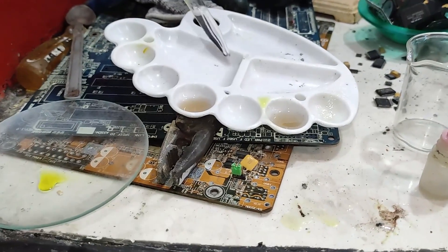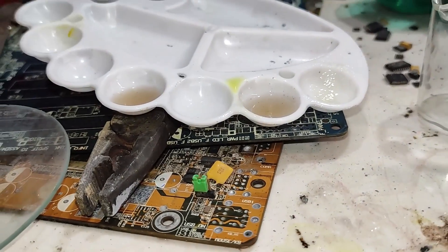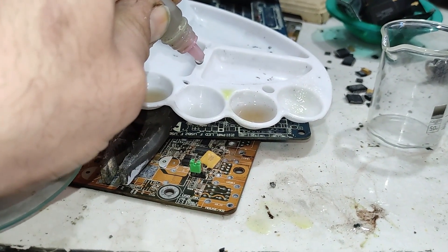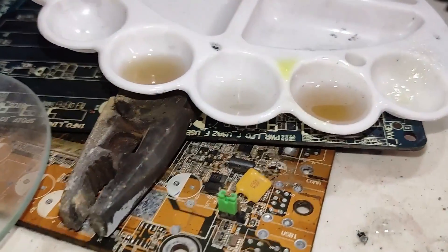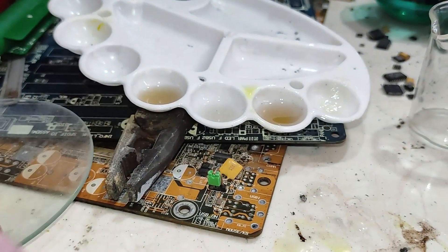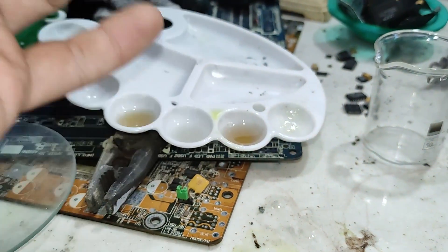As a control witness for this test, I'm going to add some tap water and add stannous chloride to it for comparison. The stannous chloride with tap water is a bit dark but totally different from this solution, which means we have some precious metals in this solution.